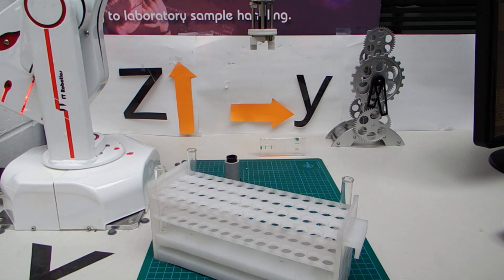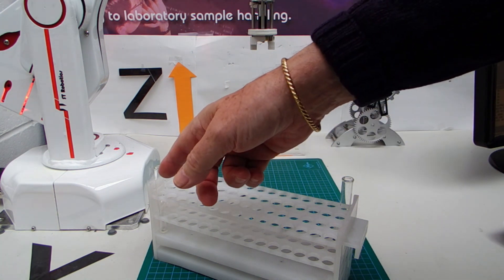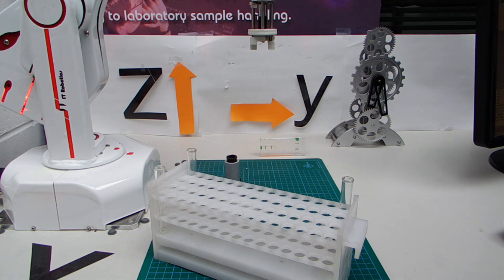To start programming a 2D matrix or grid, you go onto the Robwin computer screen and create a new route in Cartesian mode. You pick Cartesian, then pick Grid. Allow in this instance 100 lines, because this rack has got 60 positions. Then you enter 15, which is the number of positions, by 4, which is the number of rows — 15 columns and 4 rows. Click OK and you then get a list of empty positions.